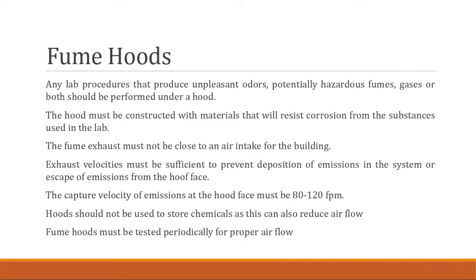Some etchants, once you mix, will then have a reactive gas or fume that could come off and be potentially dangerous.